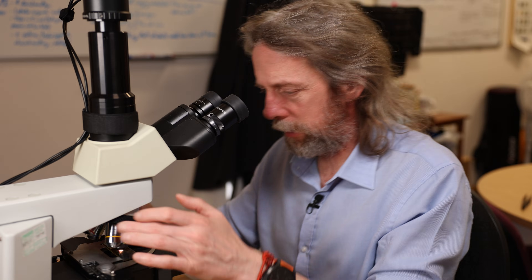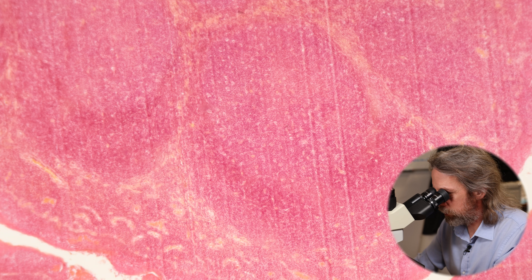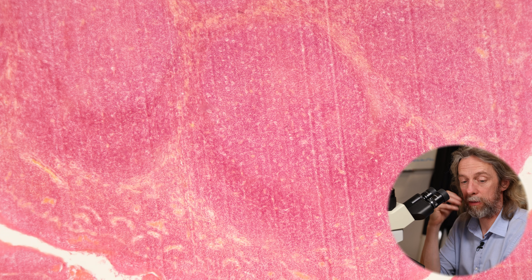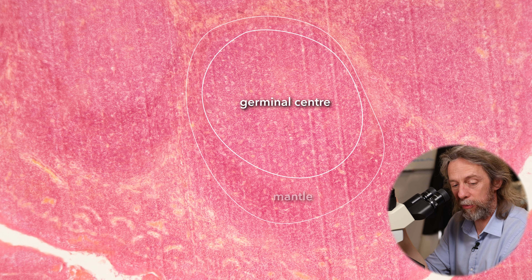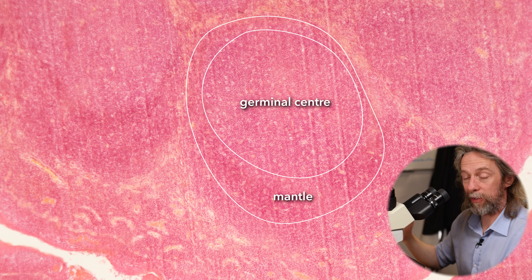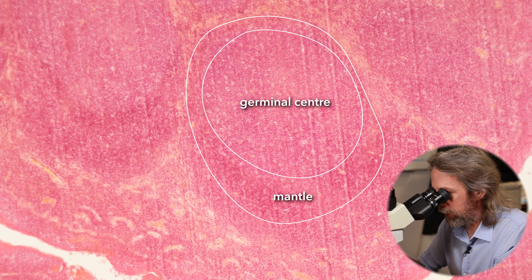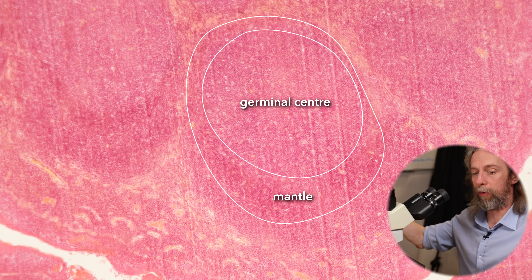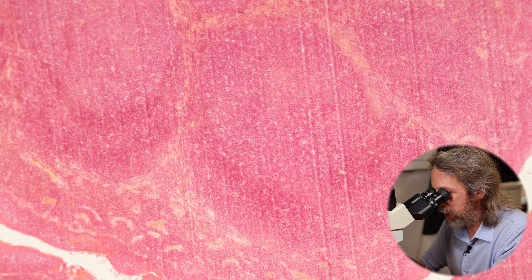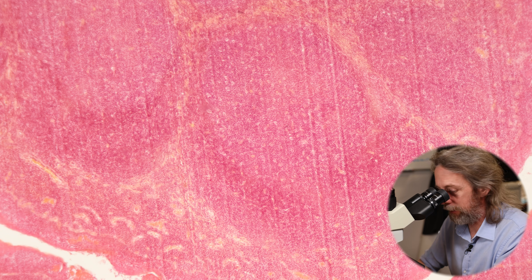Let's have a look at a nodule. There is a lymphoid nodule filled with largely B lymphocytes. It's paler in the center where we have a germinal center, where some of those lymphocytes are differentiating and becoming other cells like plasma cells that will move off to other places. We'll also see macrophages in there. Basically we've got lots and lots of nodules all packed together.